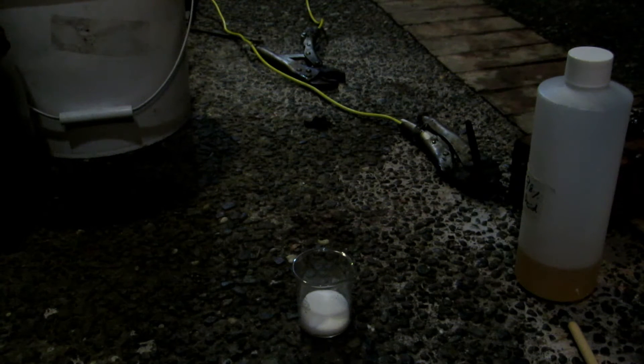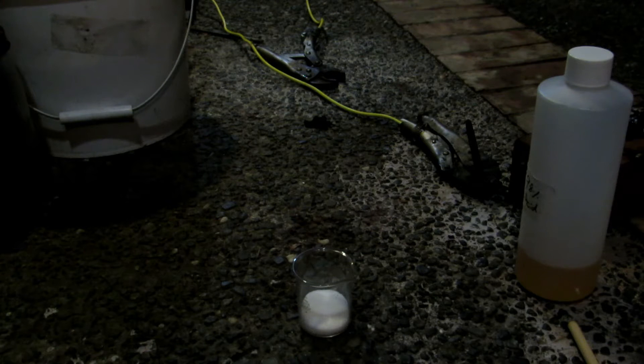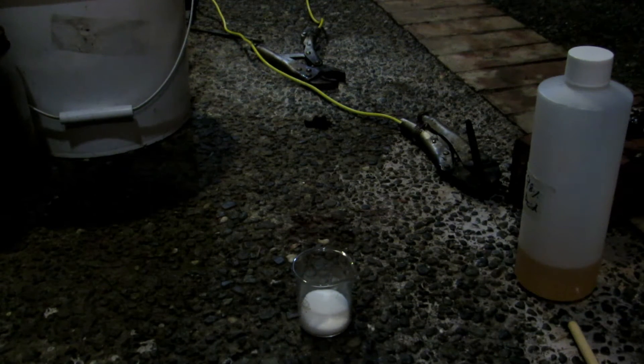Hey guys, welcome back to how to make elements from household materials. Today's element is going to be carbon. In a previous video we actually made carbon by extracting it from zinc carbon batteries. However, in this video we're going to be synthesizing it from sugar and concentrated sulfuric acid. This carbon won't be in rods, not really of any use, and is a lot more expensive to make. So it's just more of an interesting reaction that's pretty cool.